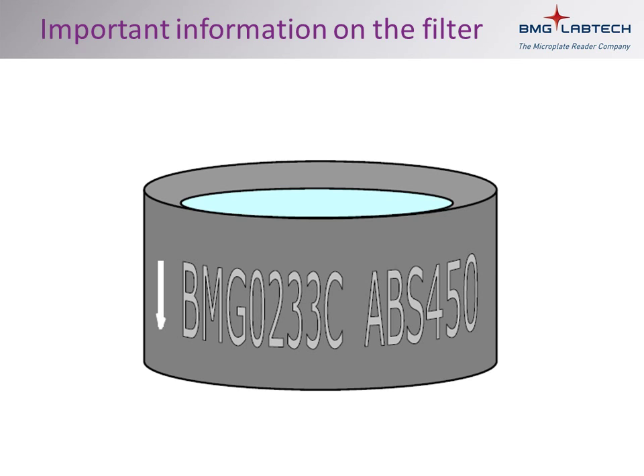There are 8 positions in each filter wheel, and it is vital that the filter table in the software is updated with the correct information.